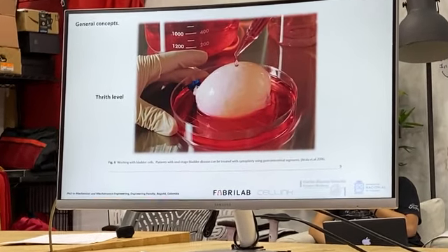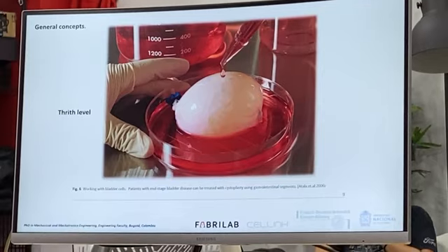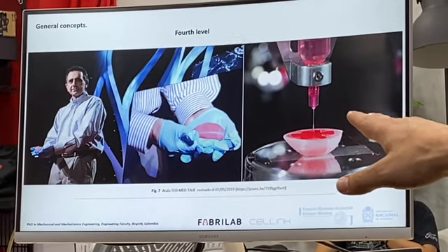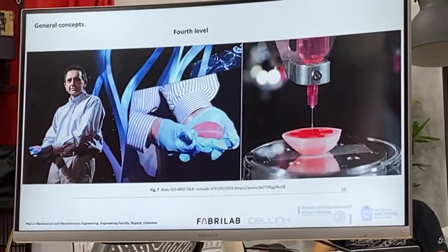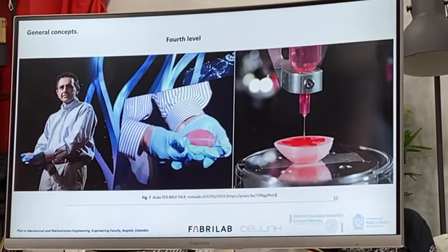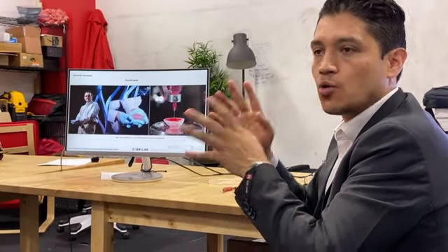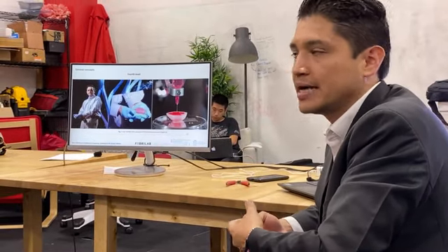Here, the bladders are seeded with cells, and they can be implanted. It is work that was developed by Anthony Atala at Wake Forest. You can see his method on the internet. He is developing at this moment a way to print a kidney, a full and functional organ. Researchers say that more or less in 5 to 10 years, you will be able to buy this kind of organ and have it implanted into the body.